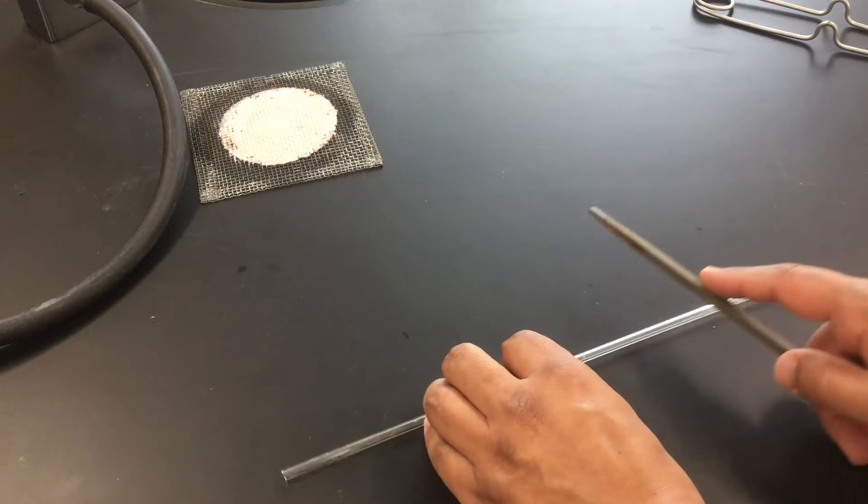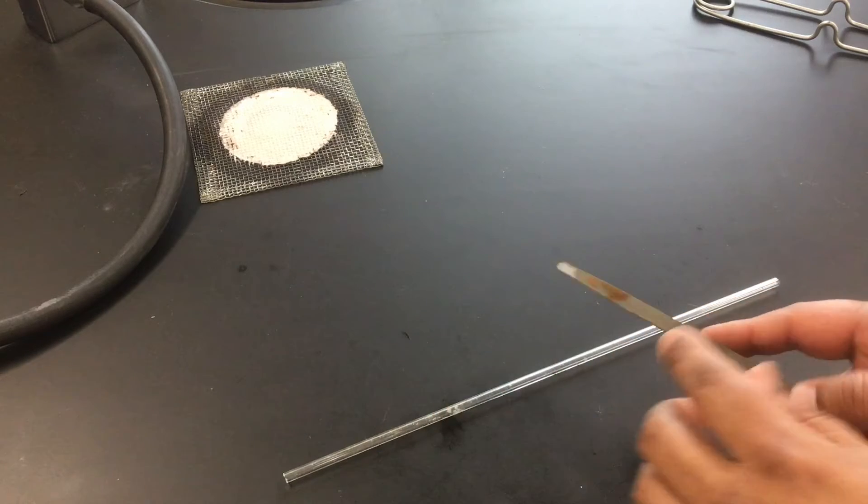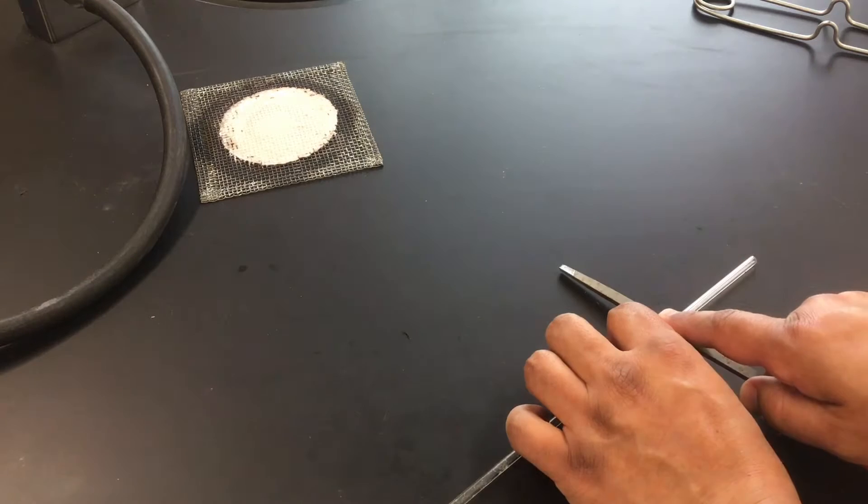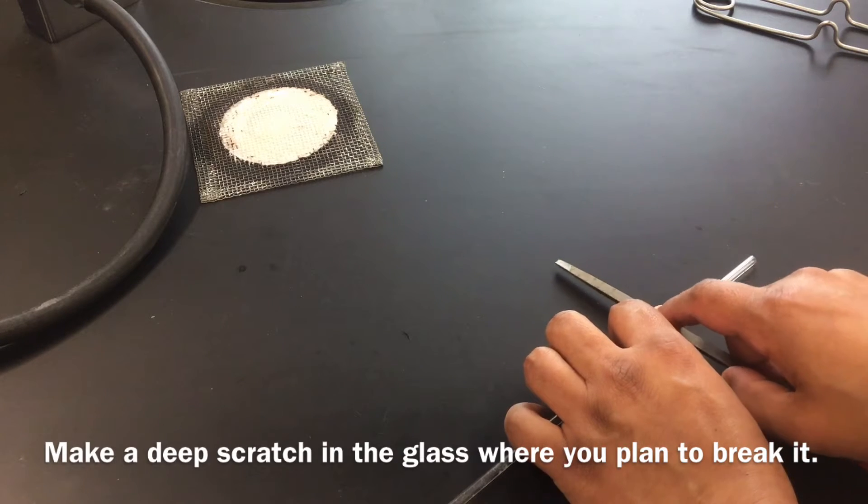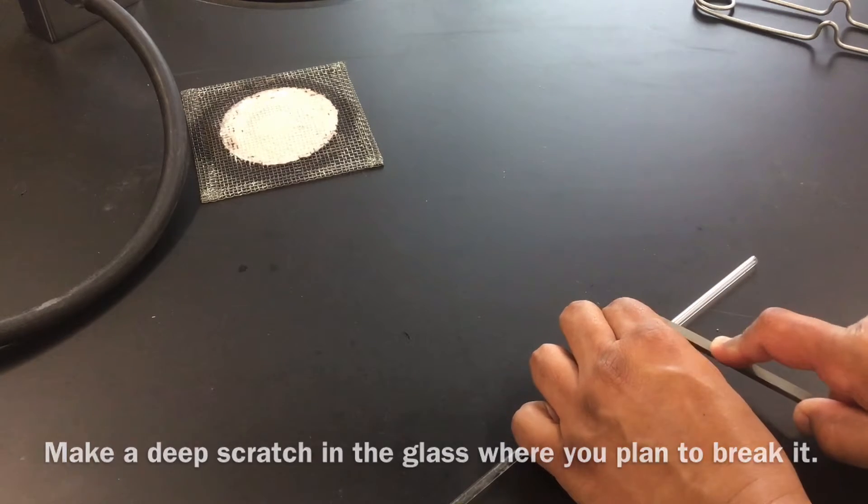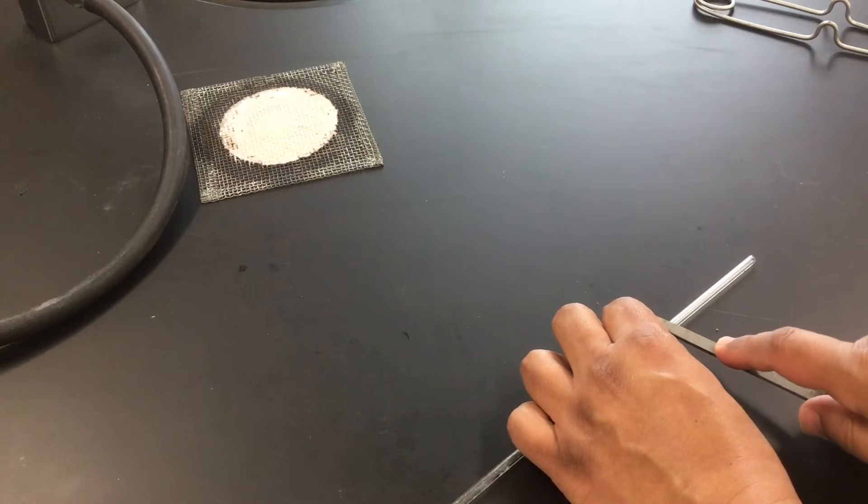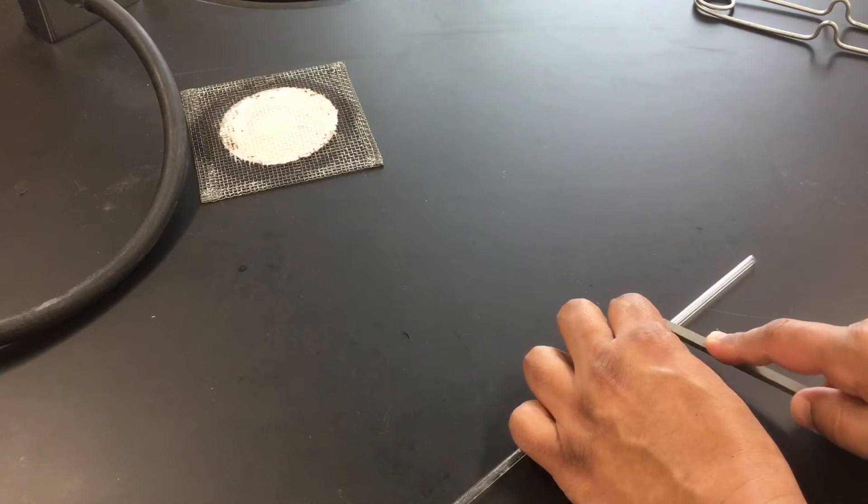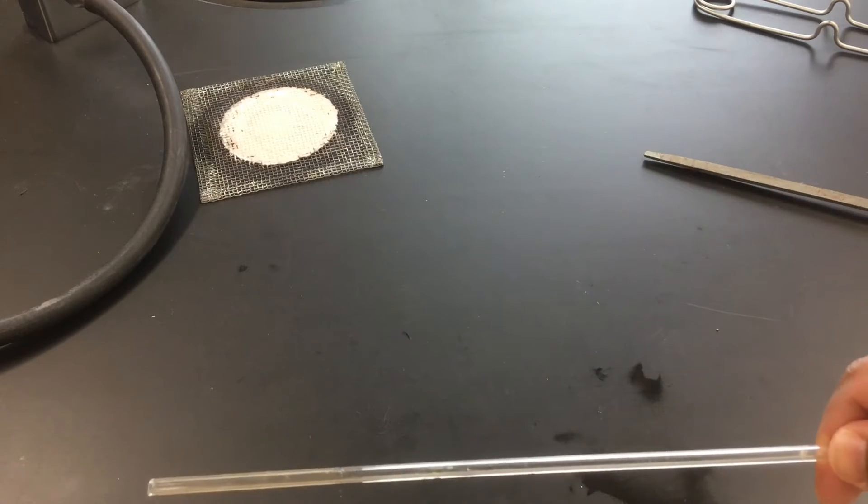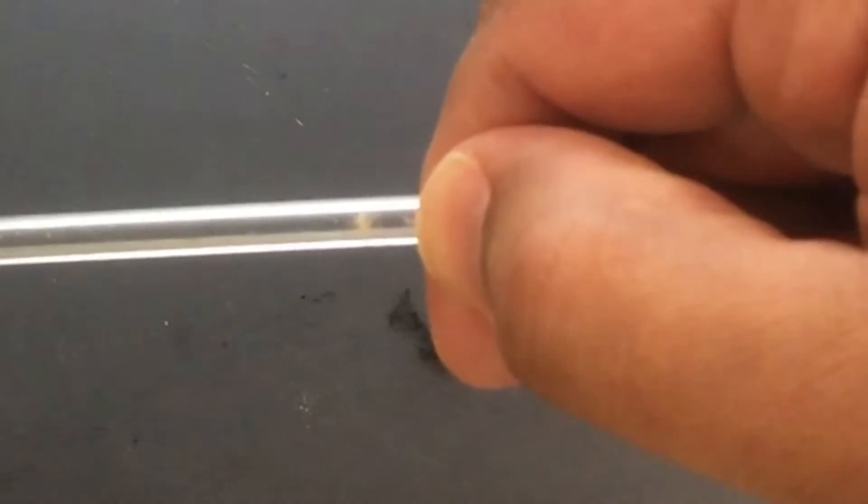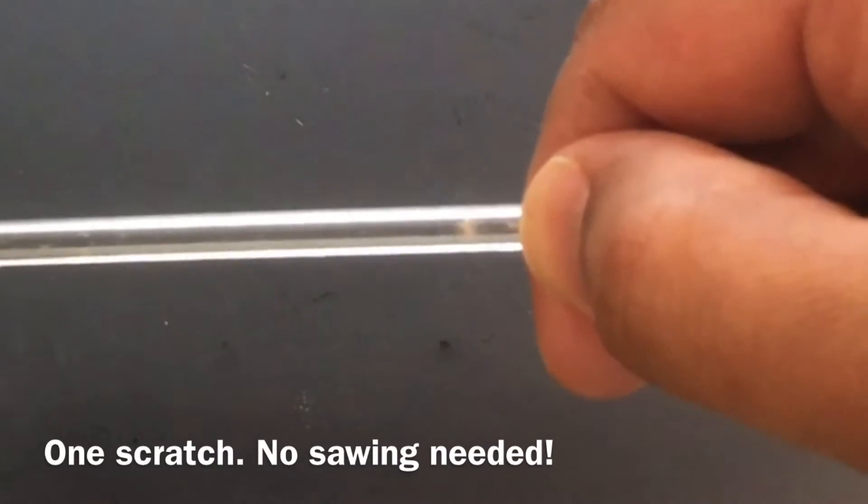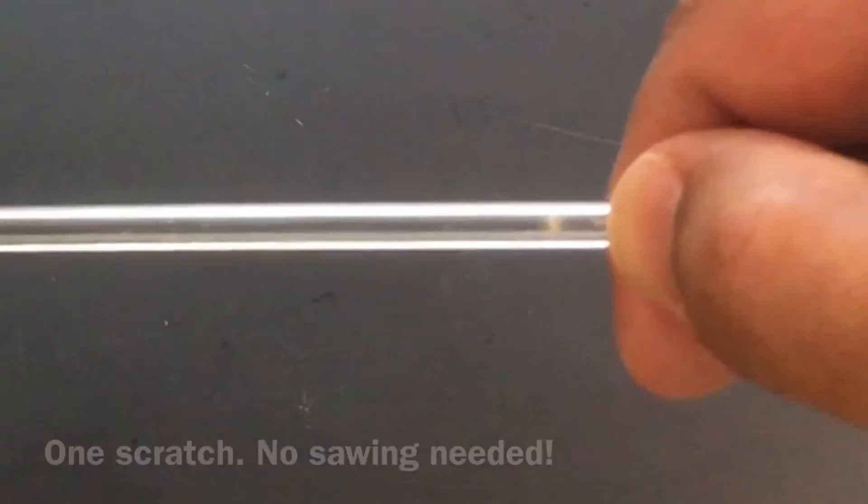We're going to take the glass piece and using our steel file we're going to make a nice deep scratch in the spot where we want to cut the glass. If you want to make another scratch in that very same place that's okay, just to make sure it's a nice deep indention. And if you look closely at that you'll see that we just have one scratch. I haven't been sawing on this, just made a nice deep scratch.